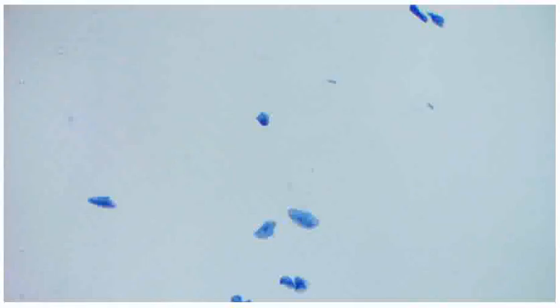Animal cells are often smaller than plant cells, so it might only be possible to see some small blue blobs with the lowest power objective lens. A different objective lens is selected to show more detail.